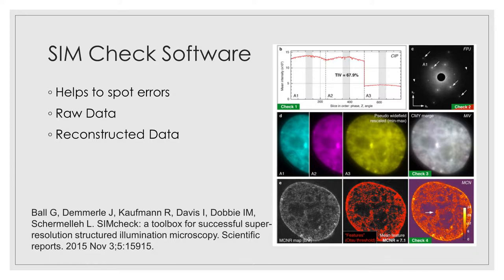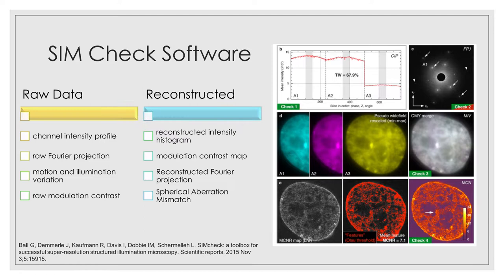There are four checks you can do on the raw data, and four checks you can do on the reconstructed data. So on the raw data, you can do a channel intensity profile. This is a plot of the average intensity in each Z-plane, and it shows if there's any photobleaching, or if the intensity changes between the different illumination patterns and angles. There's also a raw Fourier projection of the whole Z-stack of raw images. There should be first and second order spots visible, which represent the high frequency information. There's a motion and illumination variation check. This does an overlay of the five phase shifted images on top of each other, to see if there's any uneven illumination, or if the sample moved during imaging, as this can cause reconstruction artefacts. There's a raw modulation contrast check. This is the contrast of the stripes. It's important to have a good contrast for good reconstruction. And this can also recommend a value for the Wiener filter, which is applied during the reconstruction.